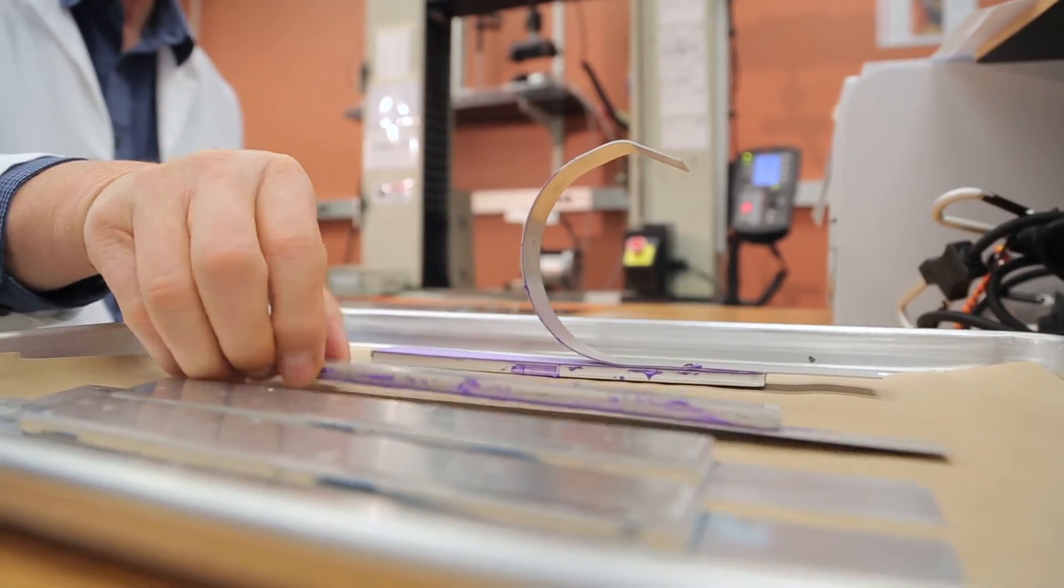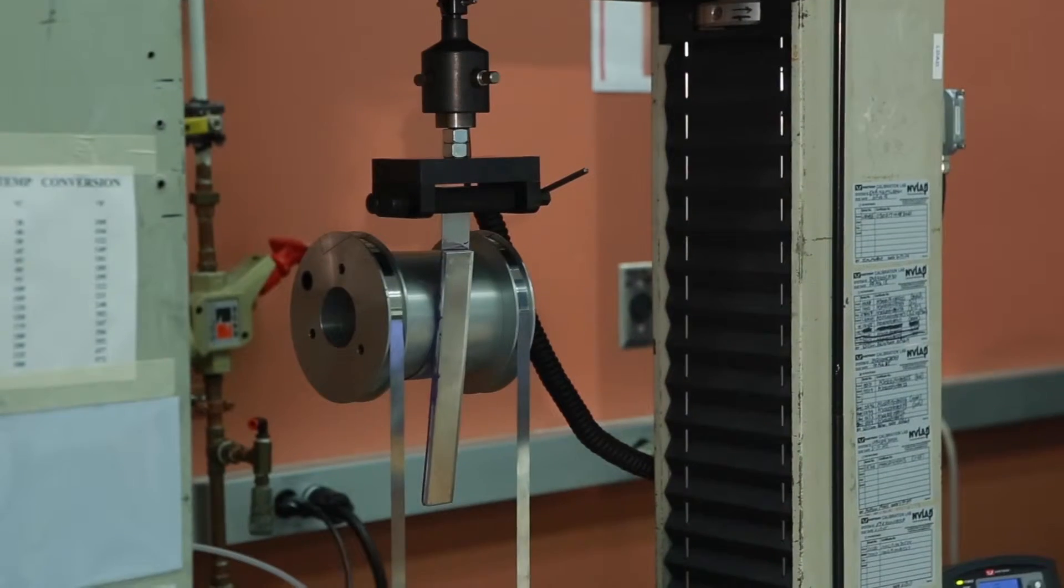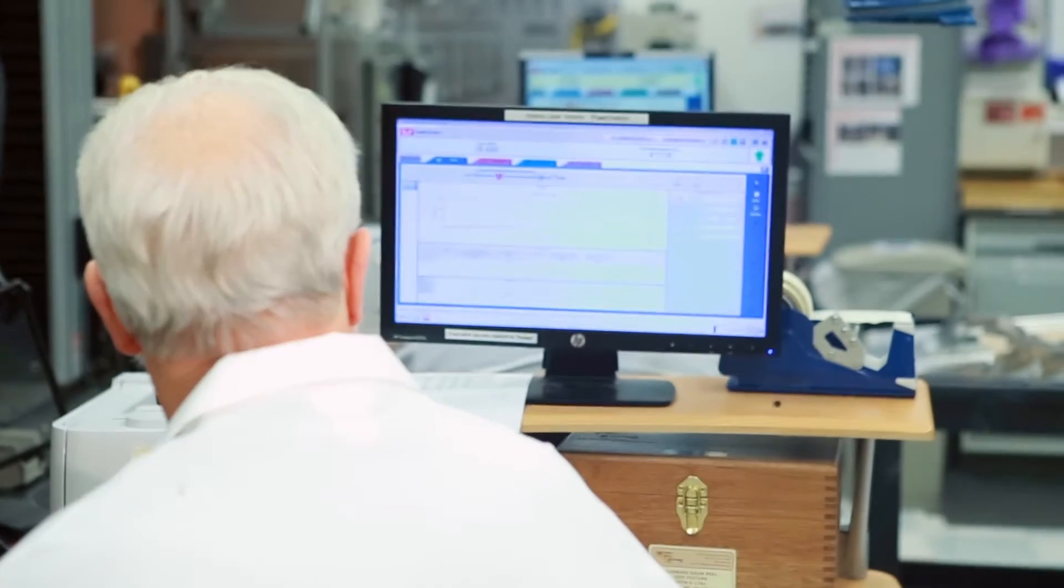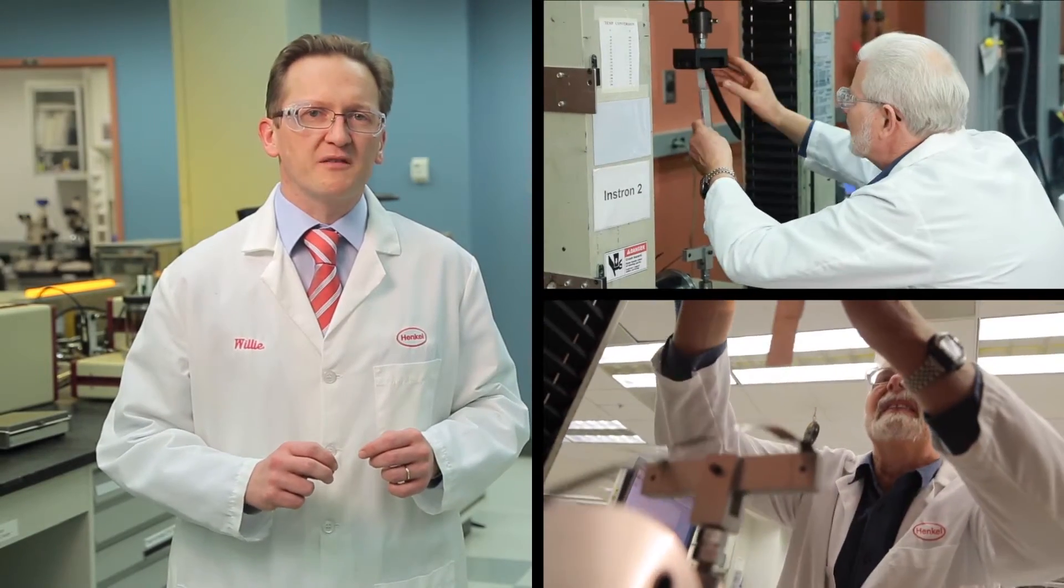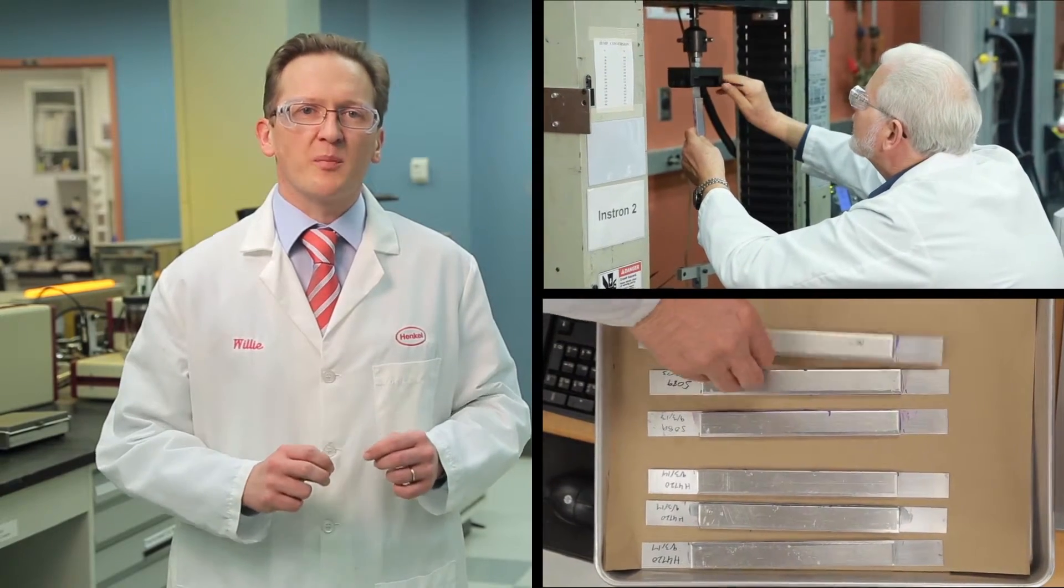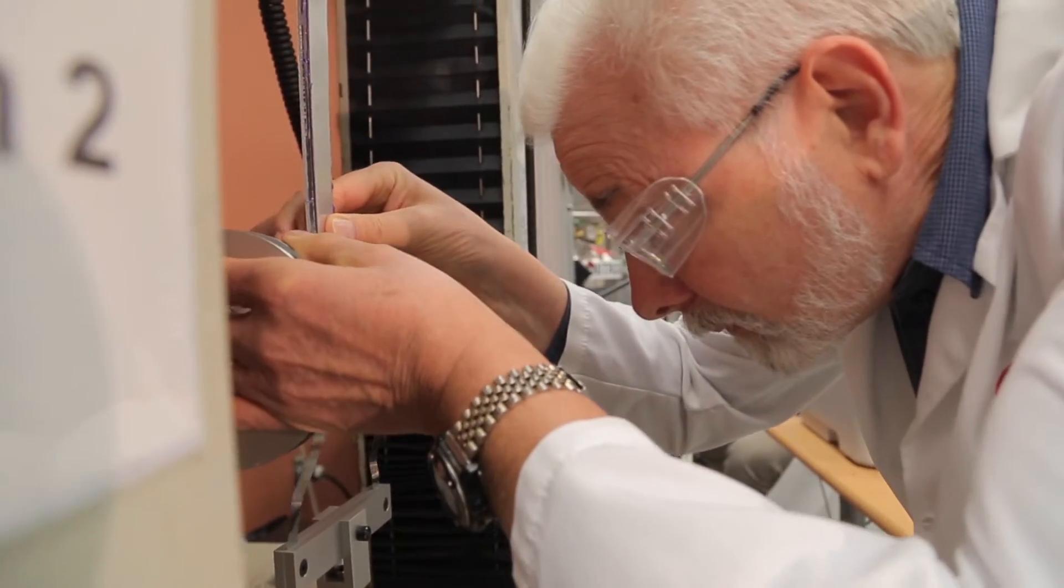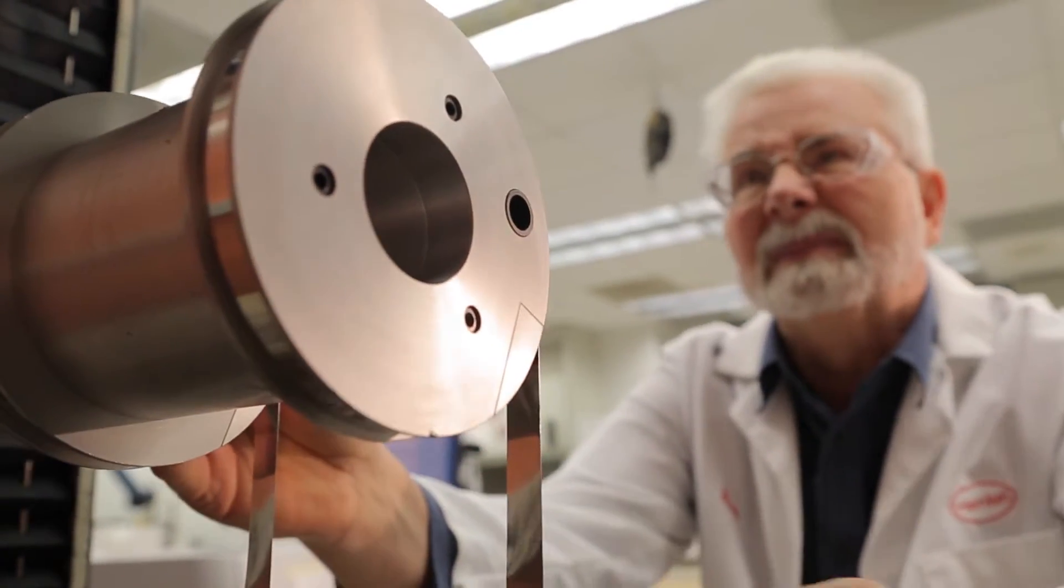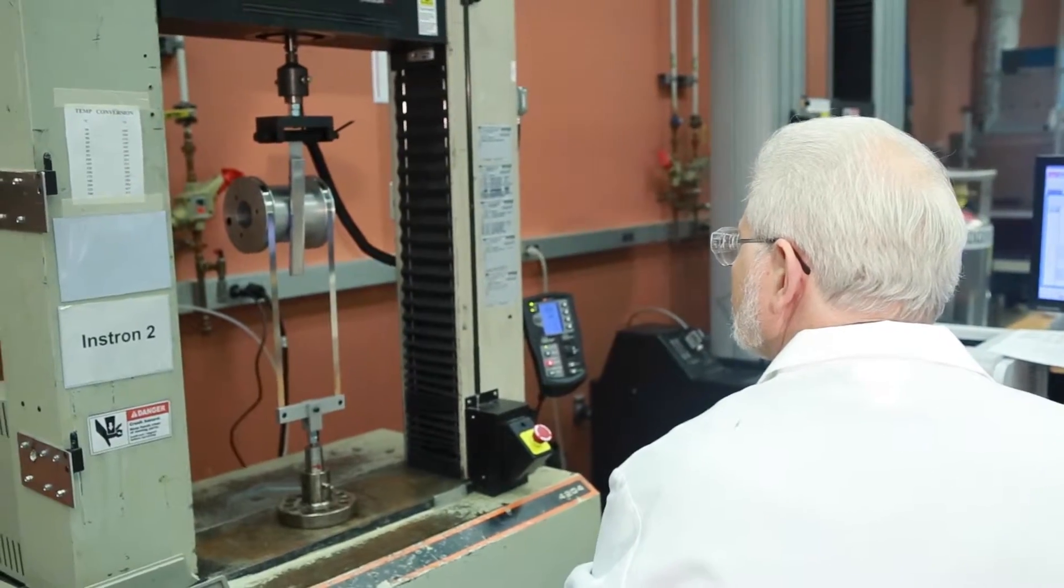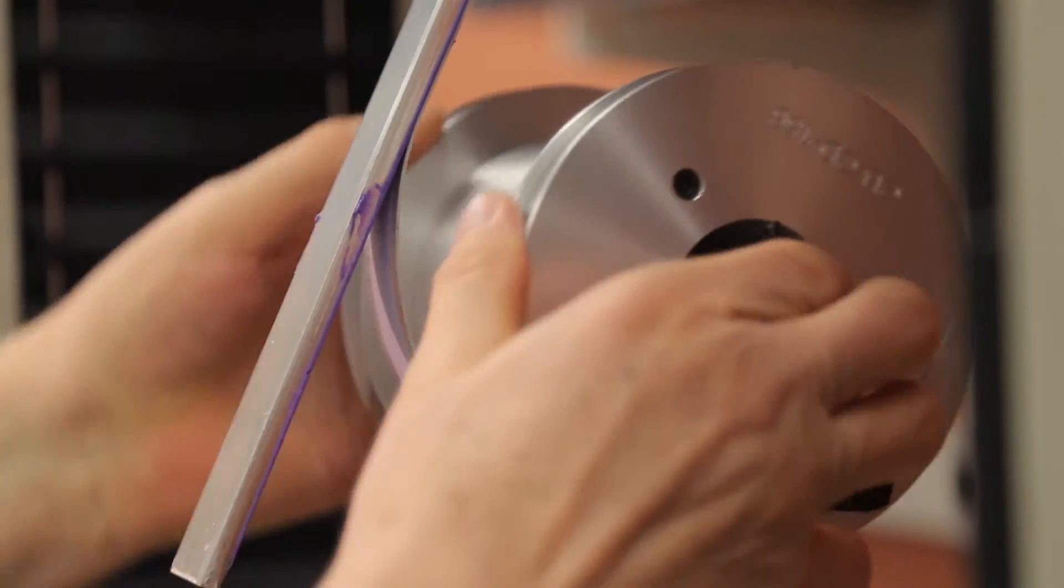When designing a bonded assembly, these loads should be avoided as much as possible. One method called the climbing drum peel test allows for calculation of an adhesive's peel strength independent of the substrate it is bonded to. A bonded assembly is secured in the climbing drum peel fixture in a mechanical properties tester. As the crosshead moves upward, the flexible substrate is wrapped around the drum fixture, peeling it away from its rigid mate.